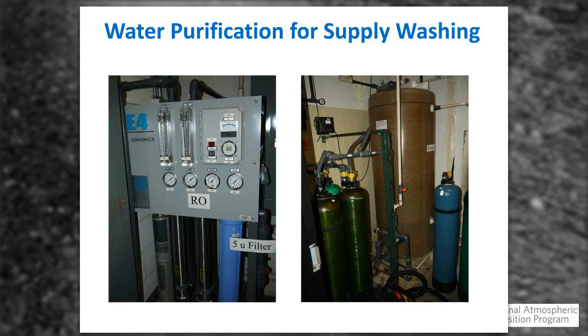And the reason we're showing this is we often get questions like, well, how come we can't wash our own supplies? Well, the reason is we have this whole setup to do industrial level quantities of very pure water. We're constantly testing it through our instruments, and we've shown that contaminated water in the cleaning can directly impact sample quality. So this is why we wash all the supplies for the program. We've done it since 1978. It's because we can maintain the quality of the source water that's used for cleaning.